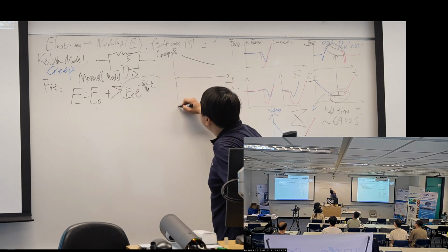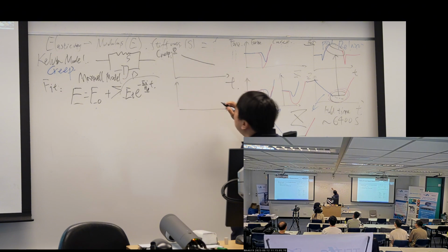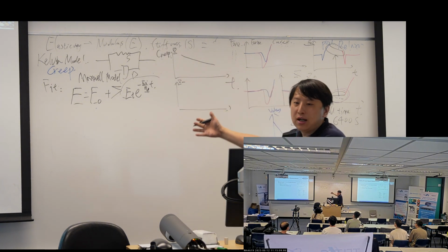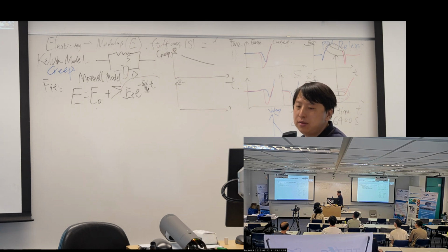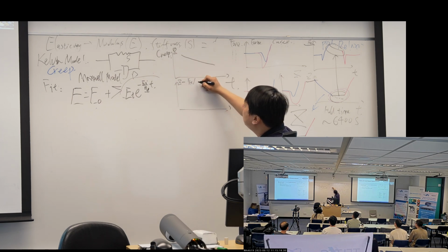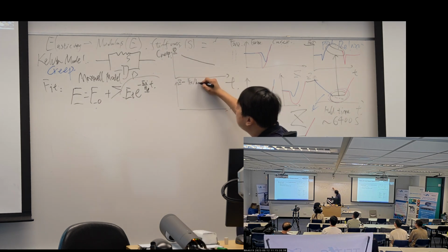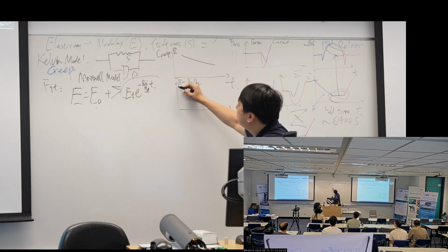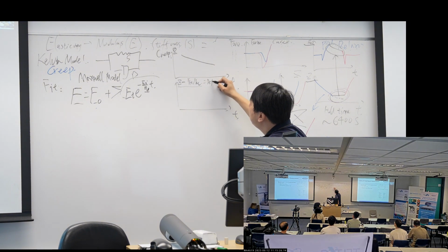So I need to do Z minus deflection. And the deflection is already a constant value because the force is a constant value. It's the holding force divided by the spring constant, Kc. This one will be the deformation.